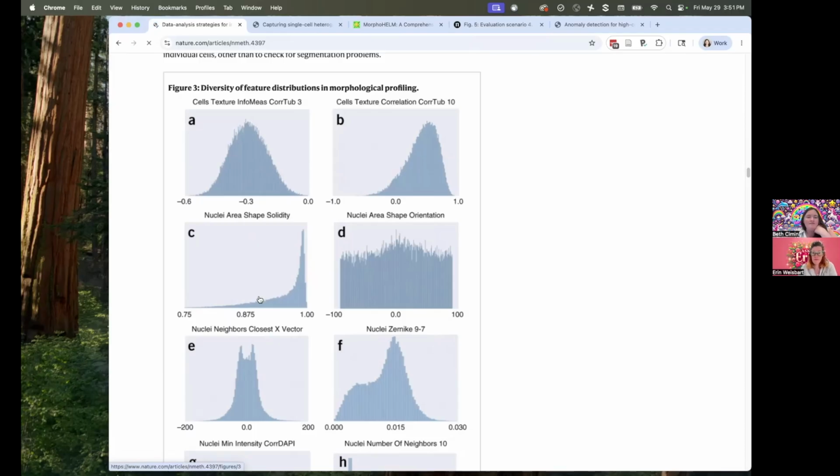Obviously, median isn't perfect here, and you're not going to get a Gaussian just by doing a median normalization, but you will have things that respond differently, and you will have lots of measurements contributing. That's kind of an unsatisfying answer.